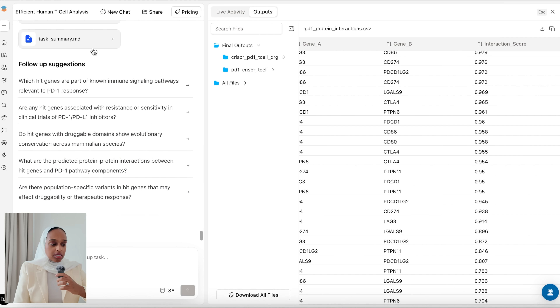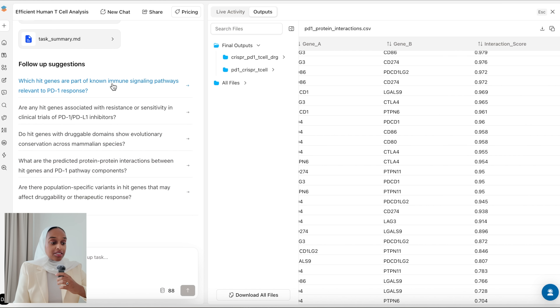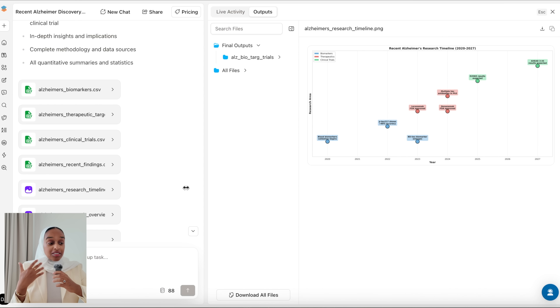Again it generates different steps and executes them, producing output files. I can really go into depth while the agent does all the work for me, saving time and being more efficient — but also providing reliable results that I can actually trust.